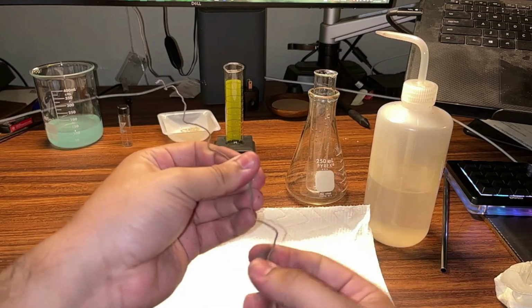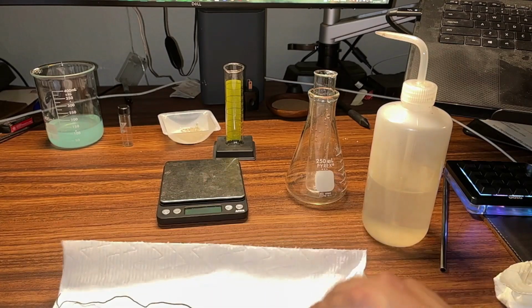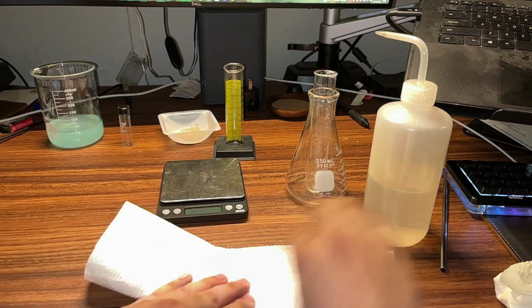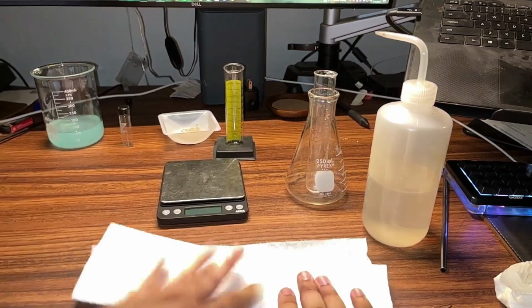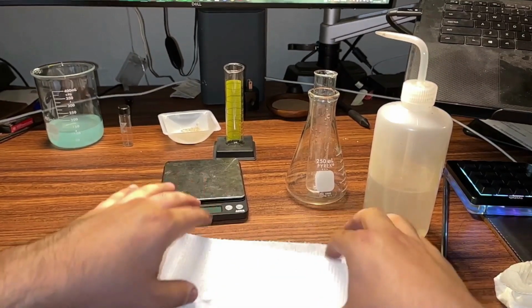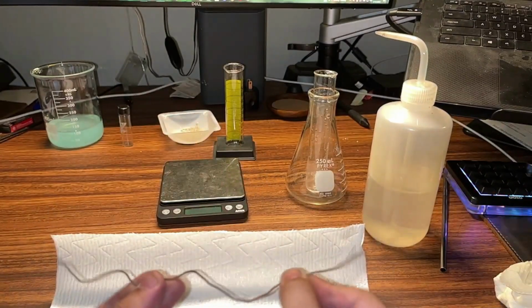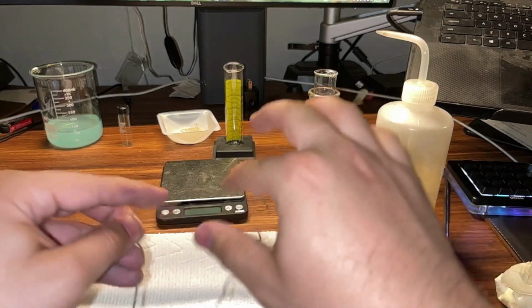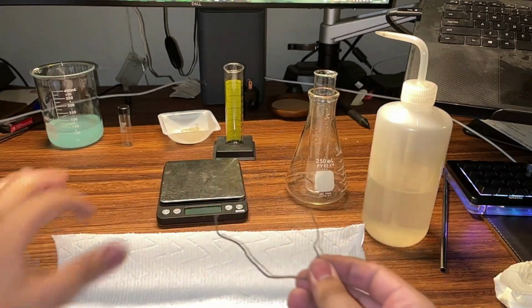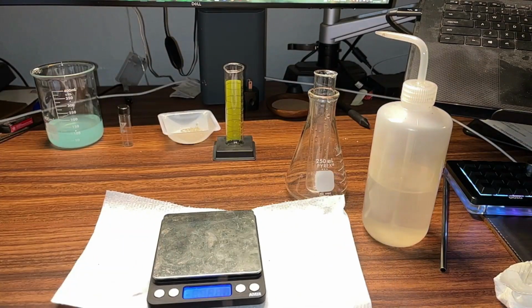So if we break off pieces and then lose those pieces, that wouldn't be very helpful here. The reason I'm uncoiling it is that it'll make it easier to dry, because it's still a little bit wet. So I'll just wrap it in this paper towel. Get all the rest of the water off. There we go, nice and dry. And then I can fold it up so it fits on my balance again. And let's move the camera now so you can see.